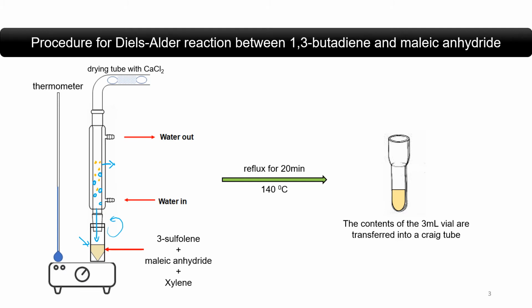mixing as well. Now we have a drying tube here which is filled with some calcium chloride, and these are two cotton plugs. This is not actually necessary, and we didn't use this when we did this experiment in the lab this Tuesday, so you don't have to worry about that, but you will see this in the experiment video.